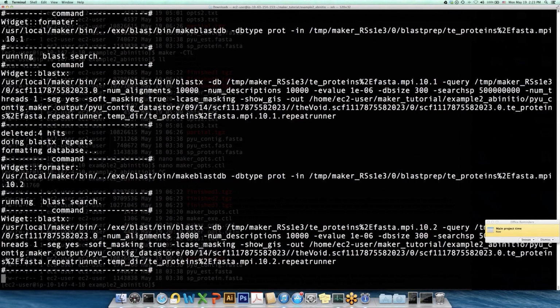for each step. It's going to run BLAST 10 times, and it's run repeat mask, and it's going to do several other steps before it even makes it to the next section of the config. So about now, this has processed almost 1 KB.